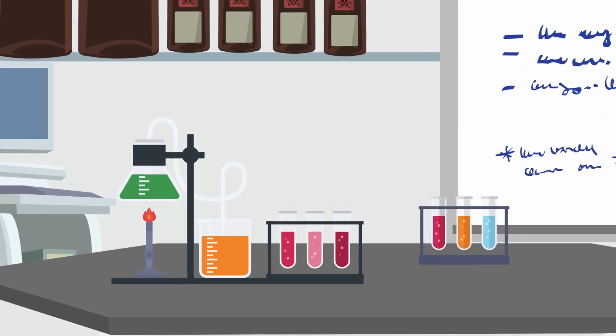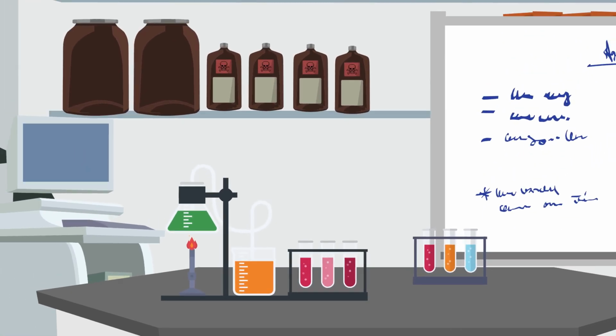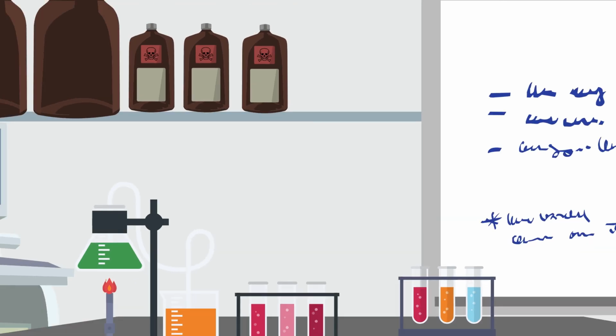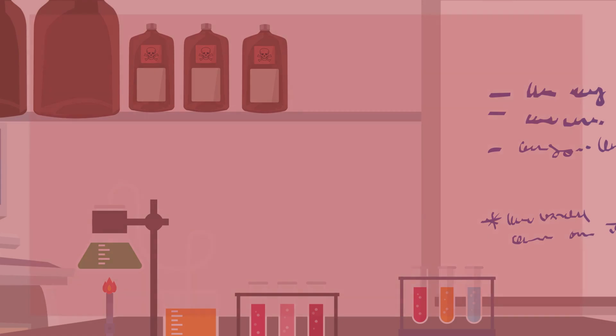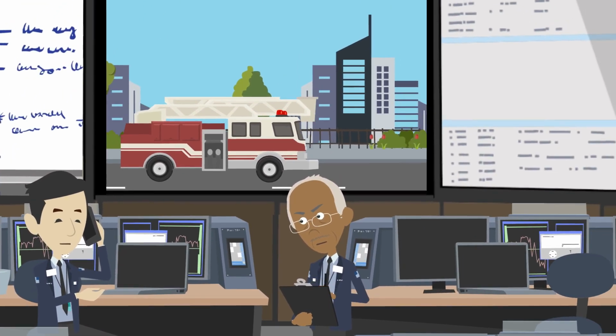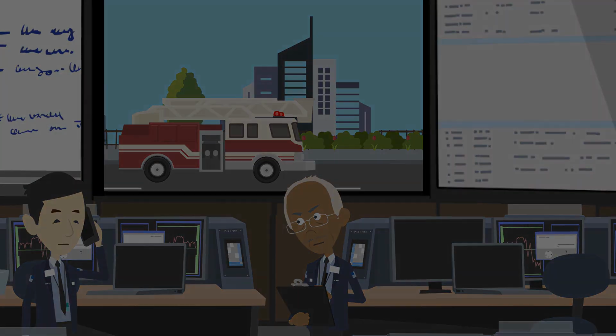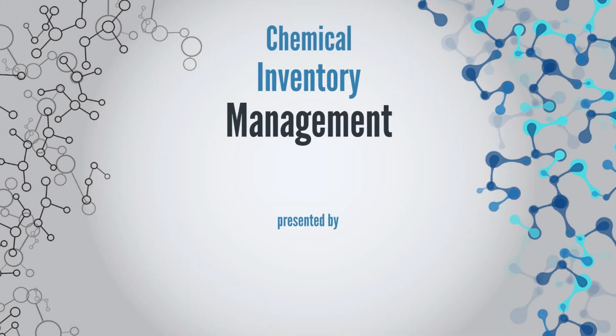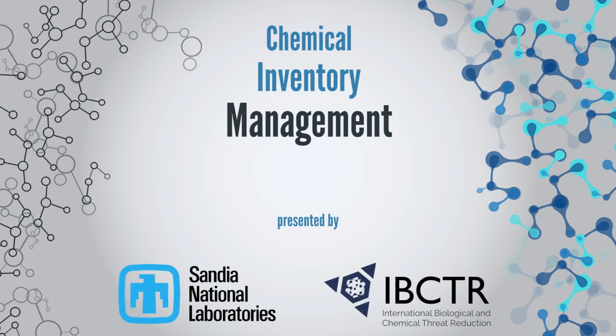Dealing with chemicals can be a risky business. While they are essential in day-to-day life, many chemicals have hazards associated with them. It is therefore important to manage their risks effectively, which includes considering material control and accountability. In this video, we will discuss how chemical inventory management can enhance material control and accountability and reduce chemical risk.